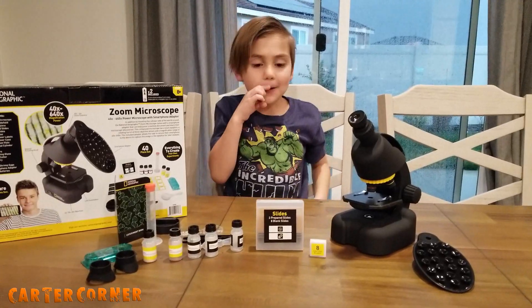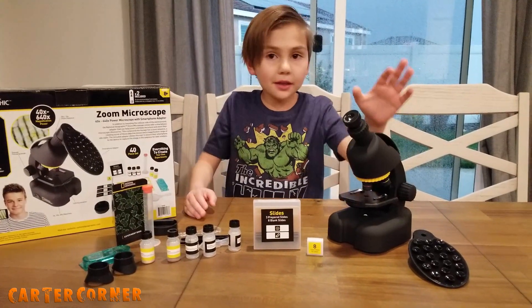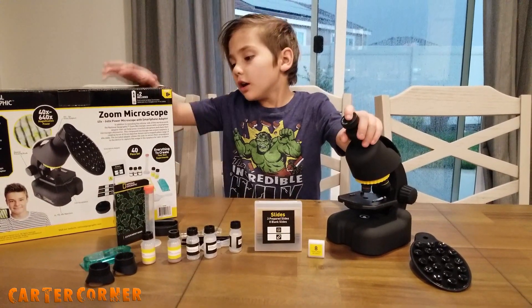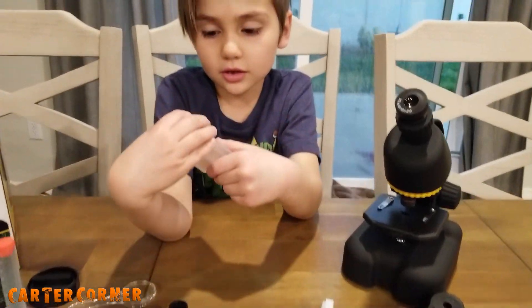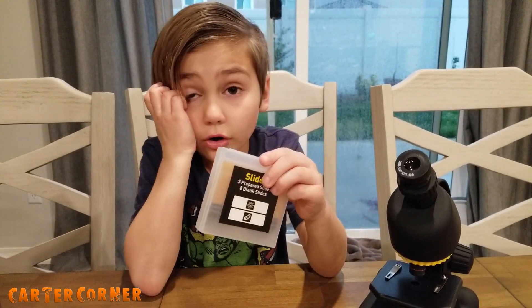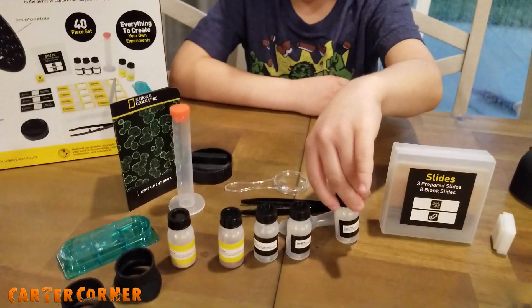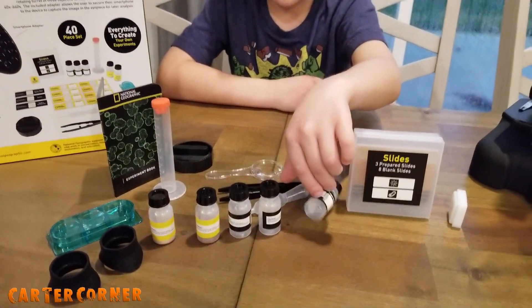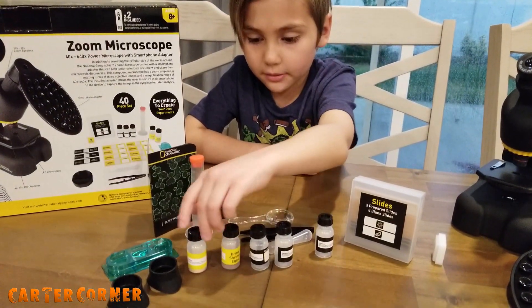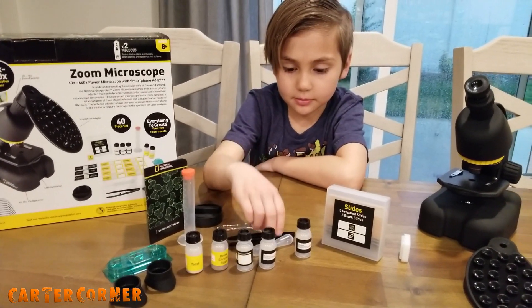So these are all of the things that come with this — the microscope. These are the slides, and there's three that are already prepared and eight to make your own. And then these are specimen bottles — there's two with brine shrimp eggs and yeast, and then three to collect your own specimens.